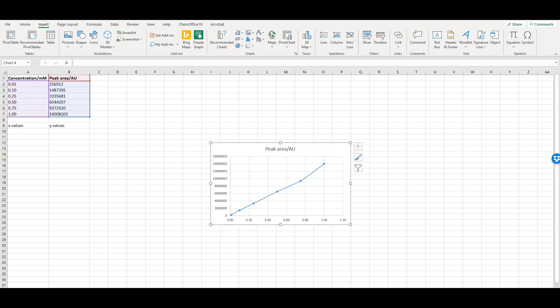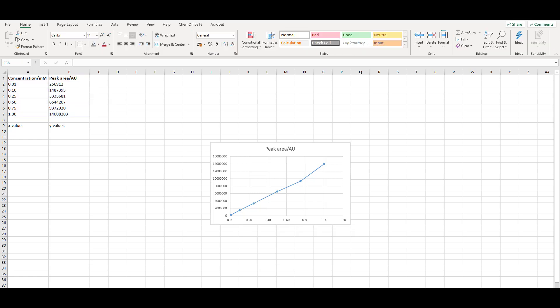The graph will now appear in the worksheet, but we need to do some formatting. The graph should have a title which describes the data. If you click on Chart Title, it becomes editable, and you can type in the title.